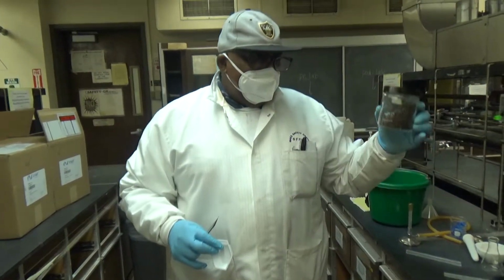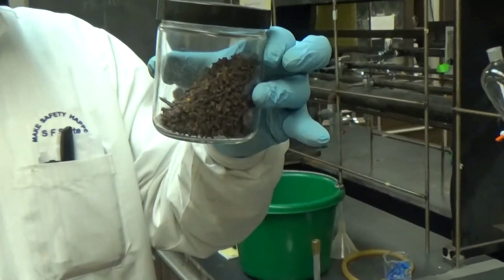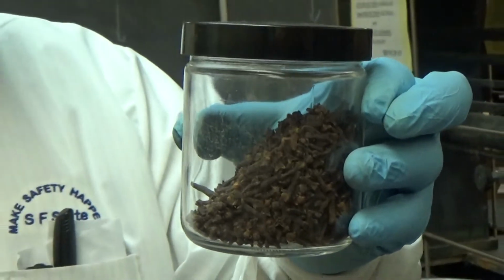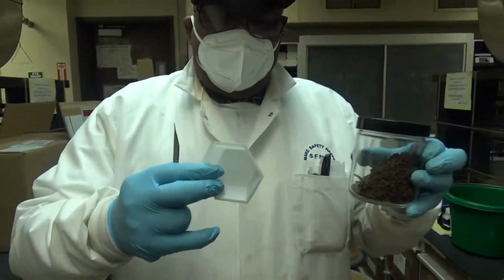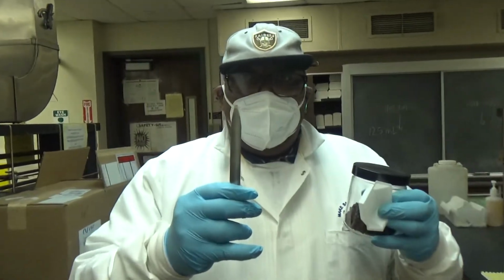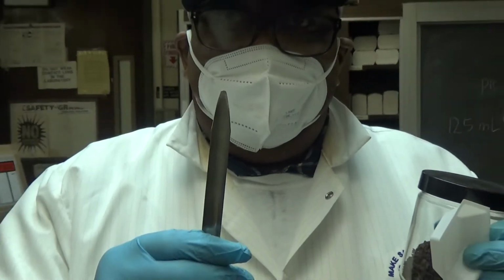So we will need 7 grams of cloves, you see here inside. You're going to weigh out 7 grams of this clove material, which you're going to be steam distilling. So you got your little weighing boat and a spatula. Actually, the big spatula, not the small one, because 7 grams is a lot.